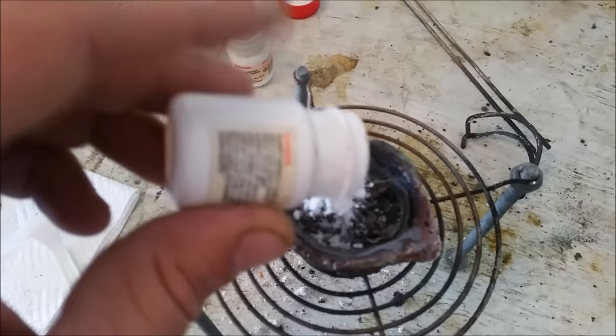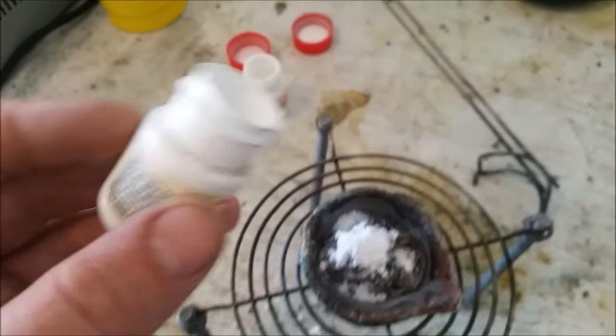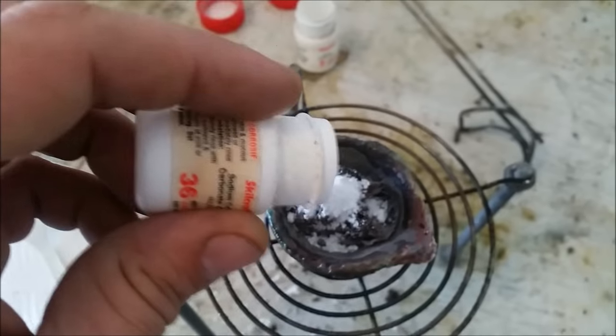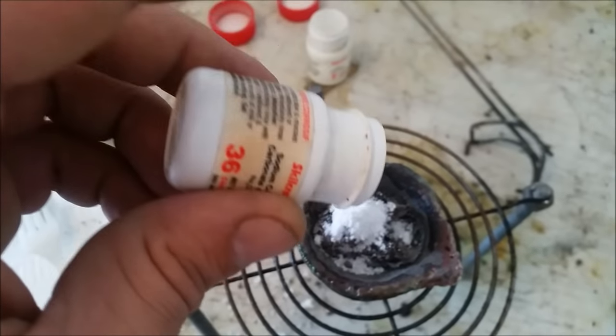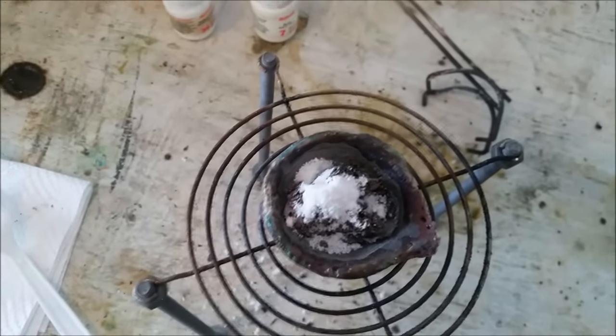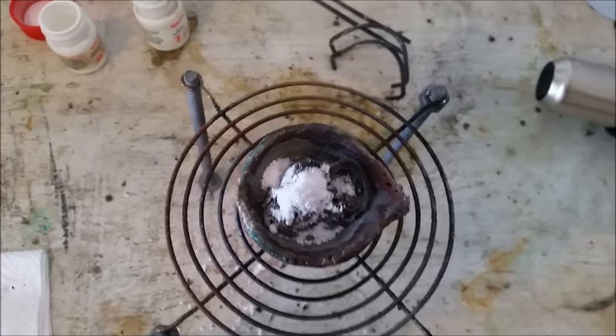This is going to be borax — this is the bulk of the flux itself. And then we are going to add sodium carbonate, which thins out the flux. If you've ever worked with borax, you'll know that it turns into a really thick molasses-type flux, and adding sodium carbonate turns it more into something like chocolate syrup — it just thins it out a little bit.